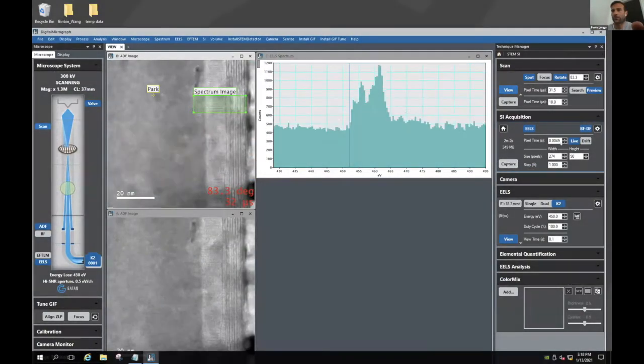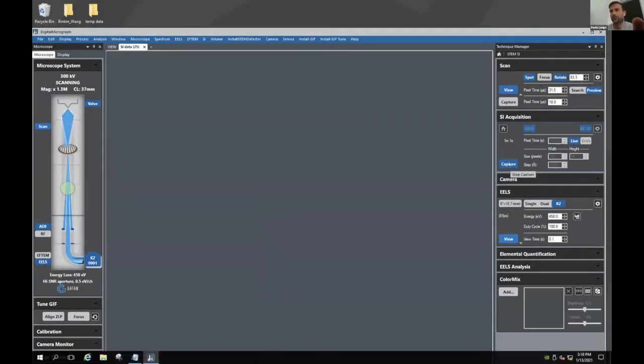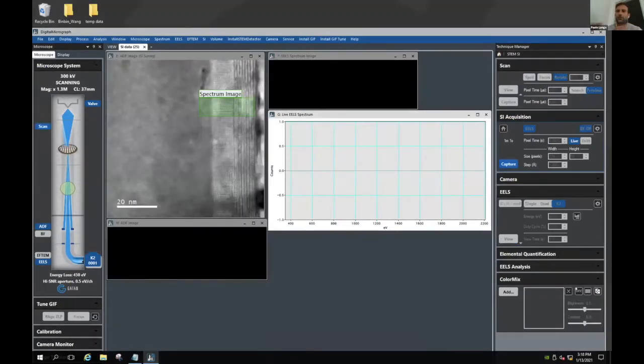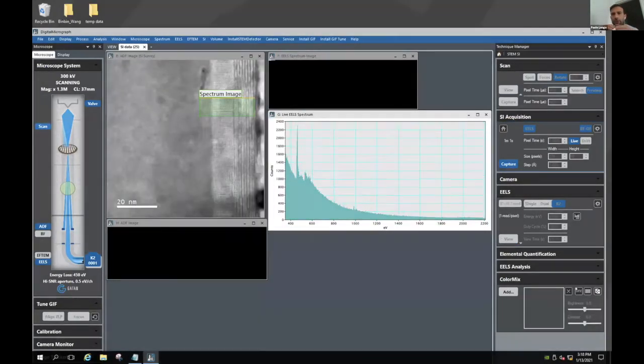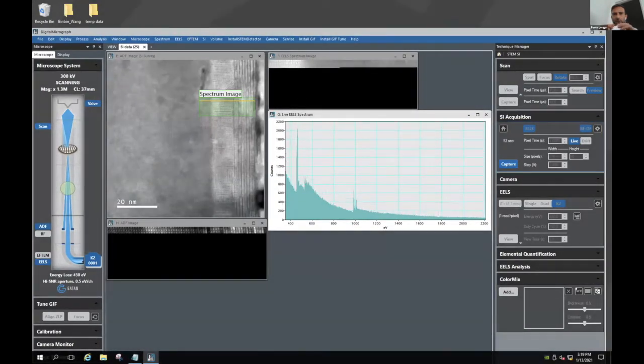And you could go on capture here. Actually, it's usually even a shorter exposure time, 2.5 milliseconds. So we'll cover all that in 1 minute. Then you click capture, and the software now is going to collect the data. See, like, beautiful spectra already. You know, nearly atomic level.